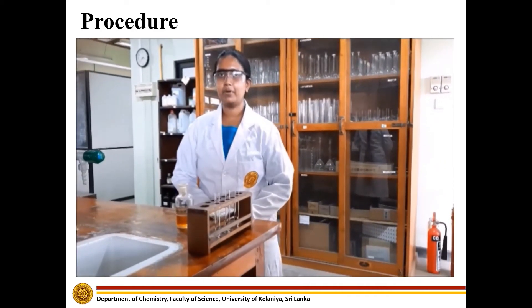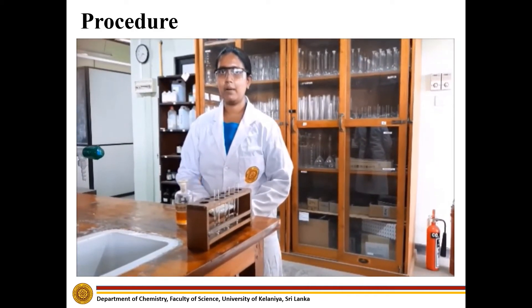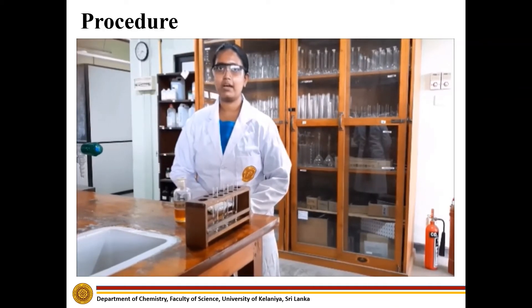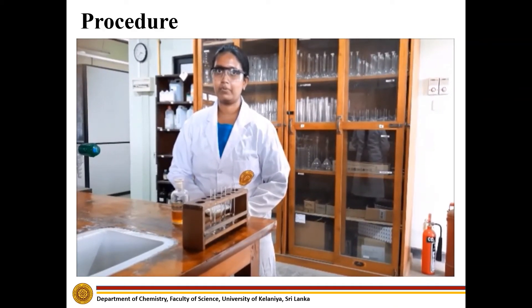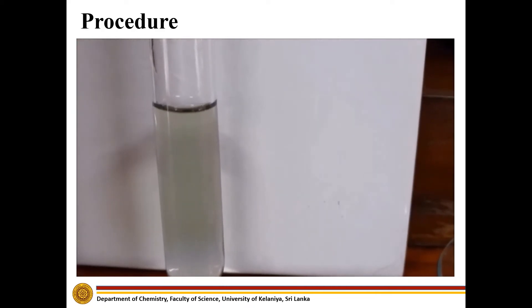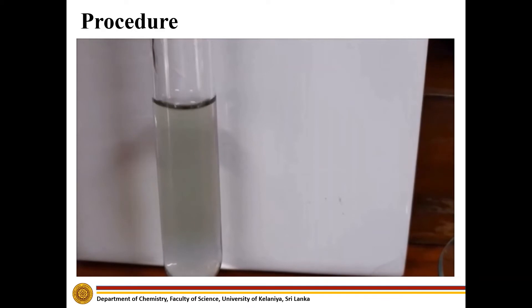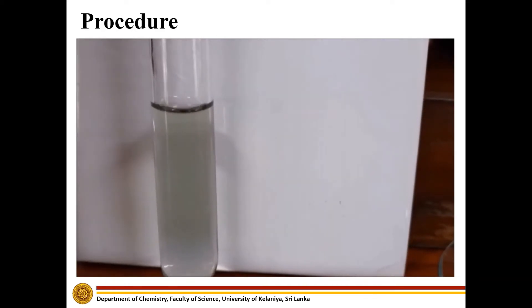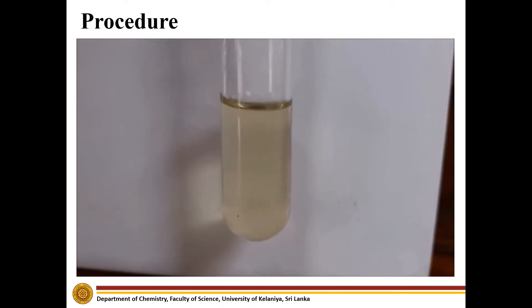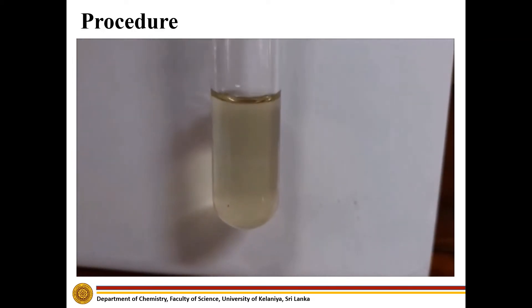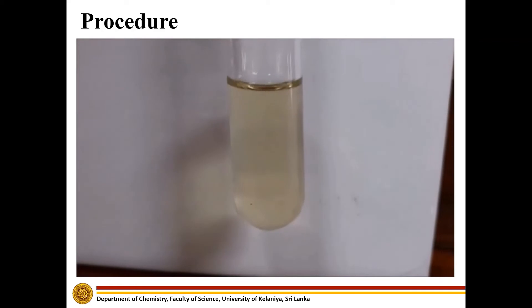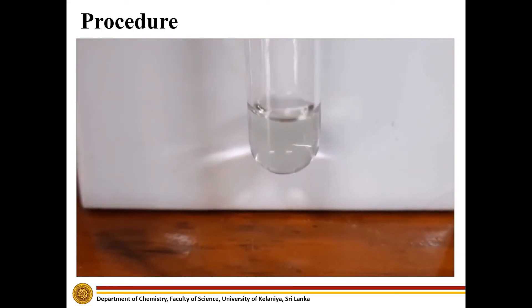Let's repeat the previous experiment by adding acidic potassium dichromate instead of acidic potassium permanganate. We can see a pale green color in the test tubes. The chemical solutions in the test tubes contain acetaldehyde, benzaldehyde, and acetone.